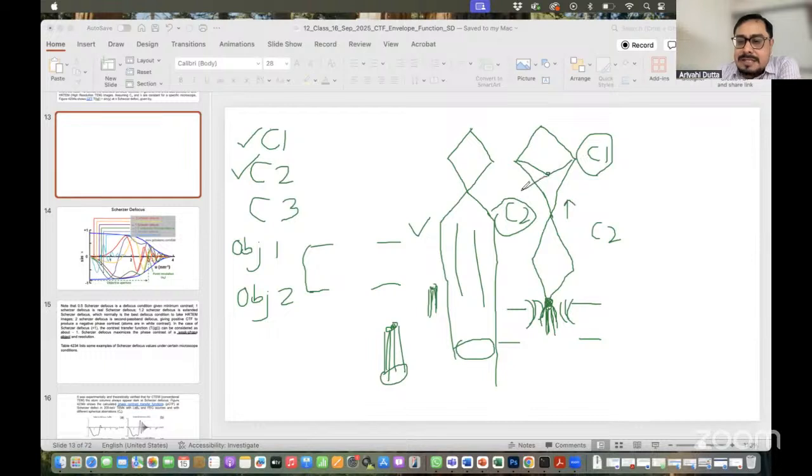And now you can see your beam is spread out like this, right? If your beam is spread like that and you put an aperture here, you are going to block most of your electron beam. That is one of the reasons for biological science samples we use a strong C1 lens current or magnetic field, which will shift the crossover point upward. The beam will be spread too much, and then we use the aperture and block most of the electron beam.